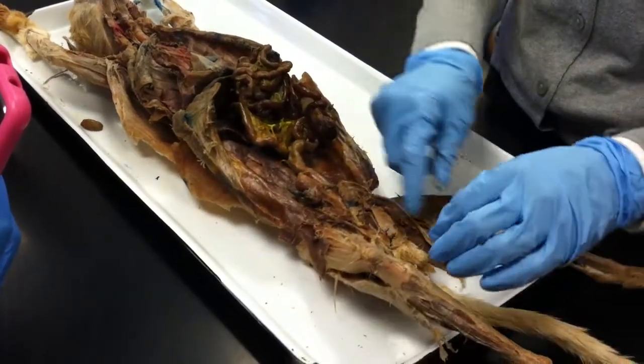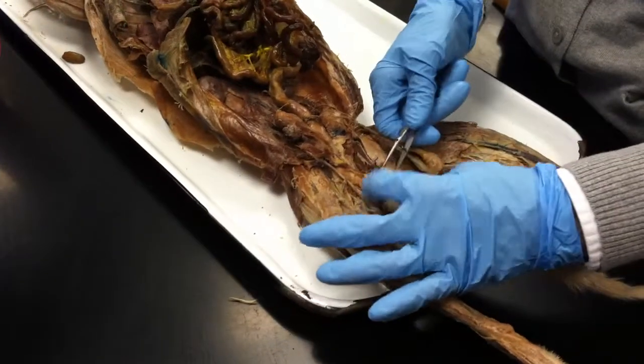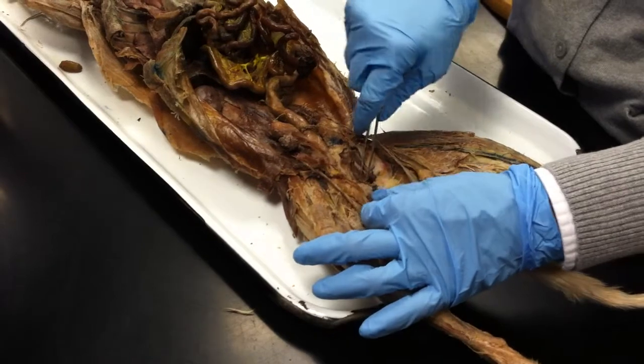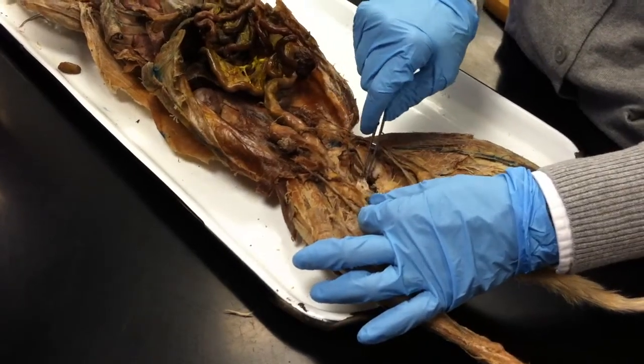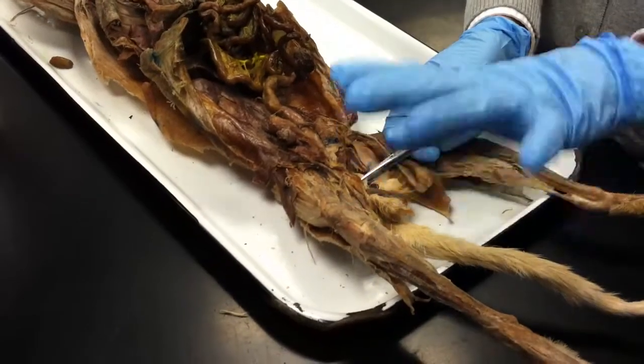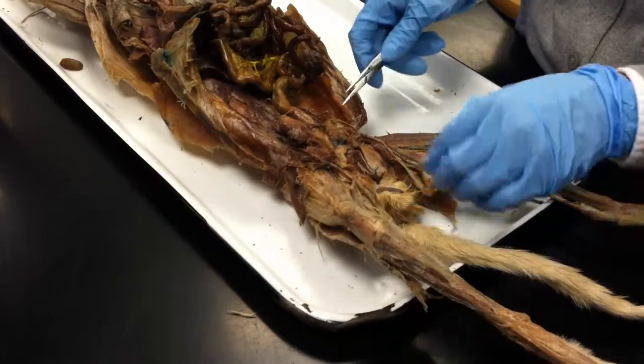Where the heck is his penis? Oh, here it is. Okay, this is the penis. This is the glans penis. This is the shaft of the penis. This is the crus penis up here. That's just the ligaments and the muscle that attach it to the body wall. And that's really all you can see on this poor fellow.